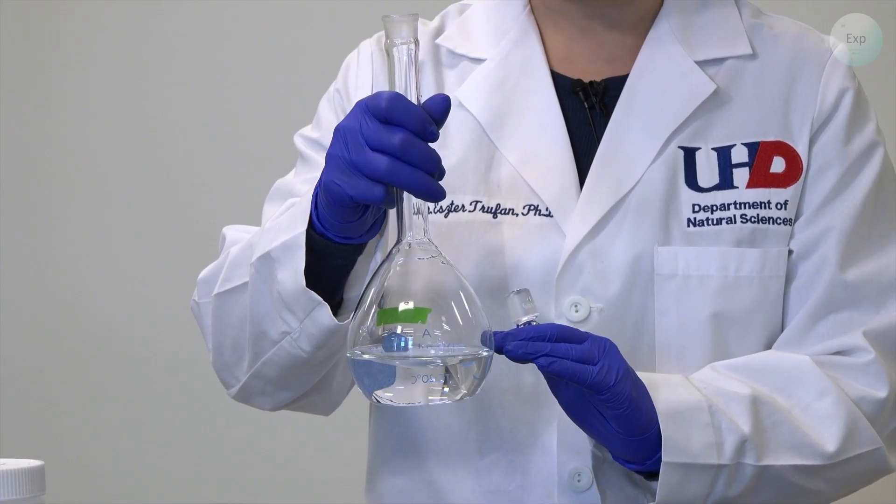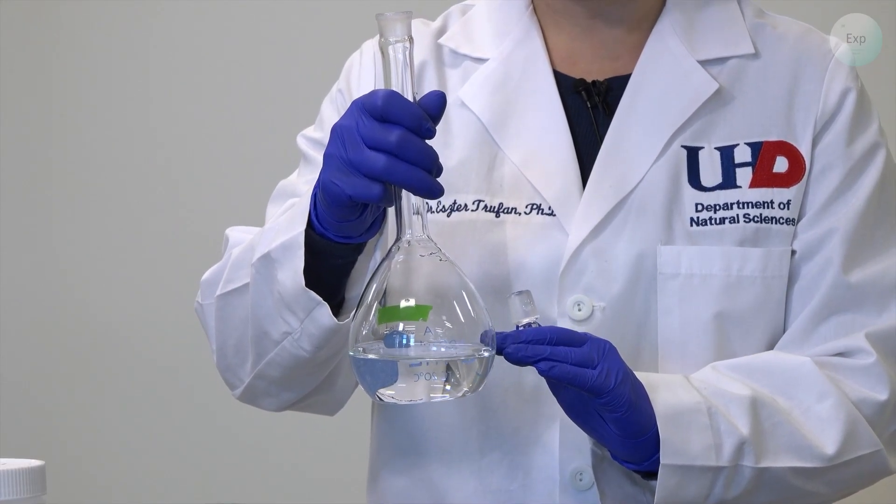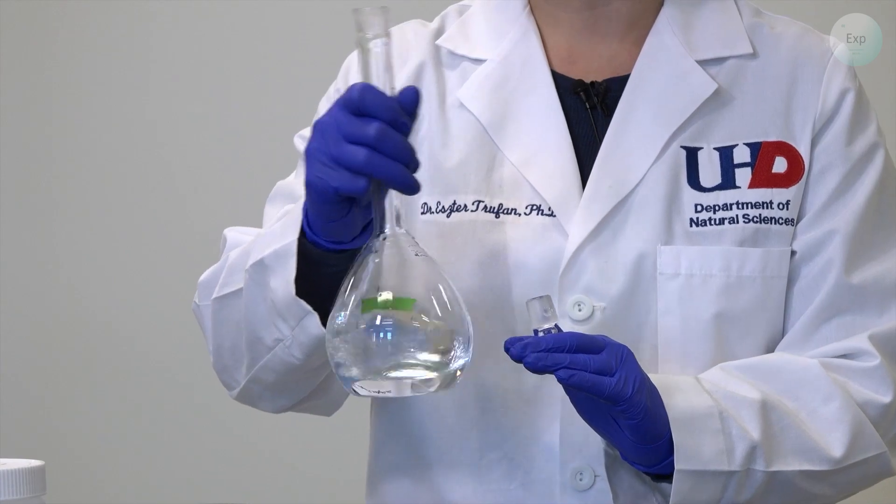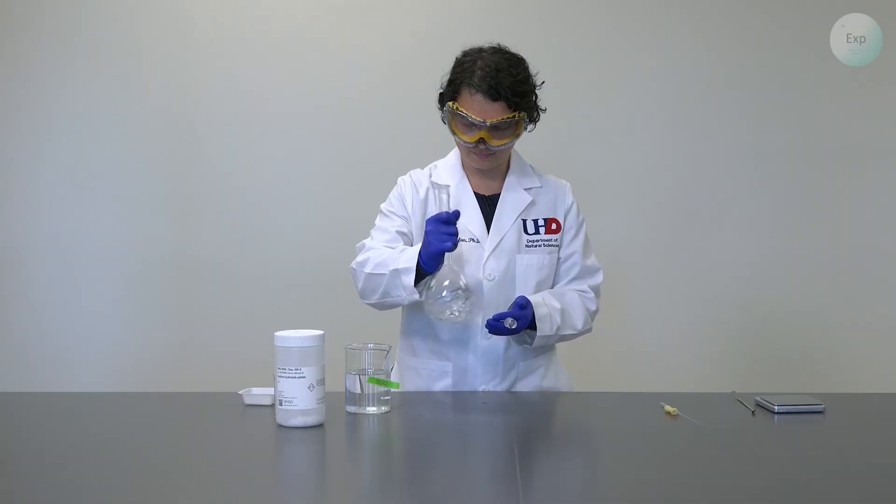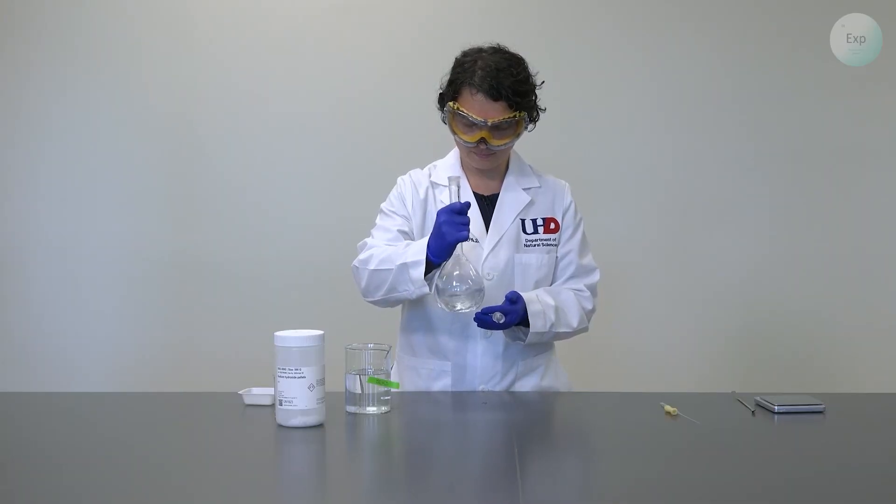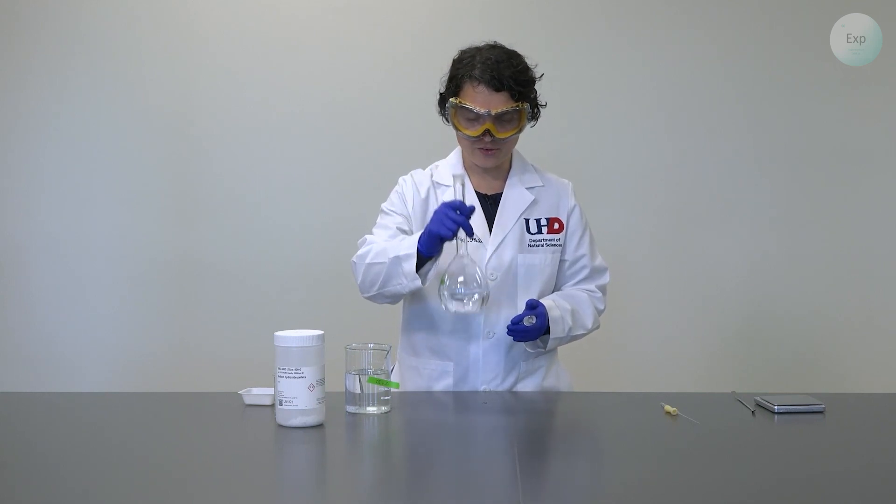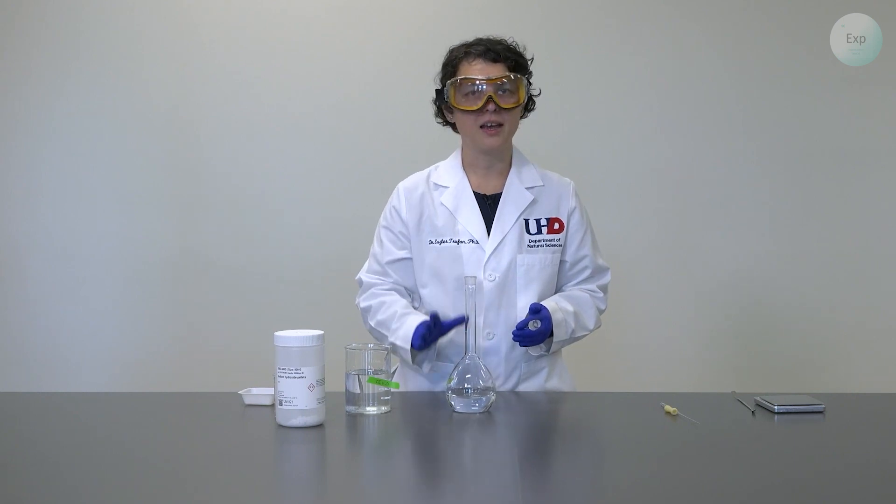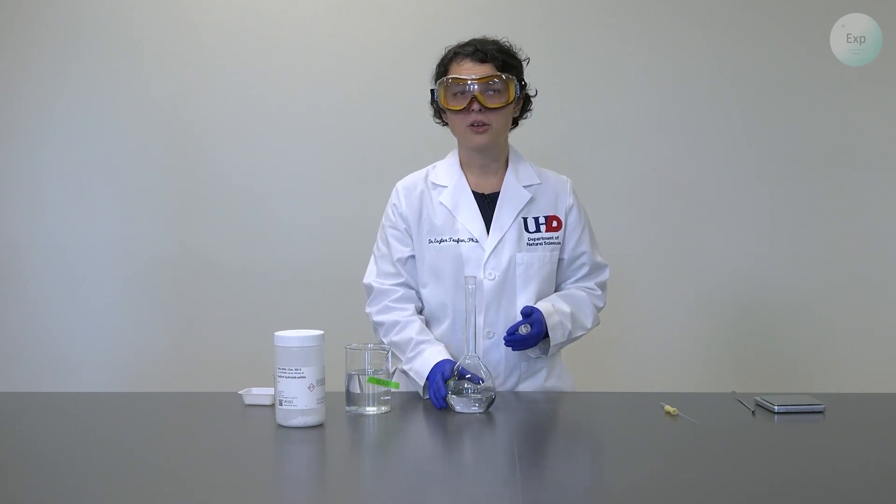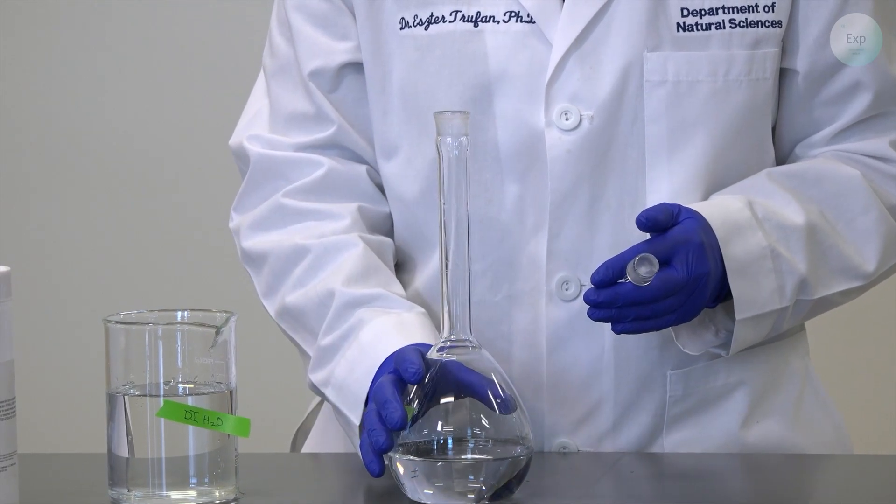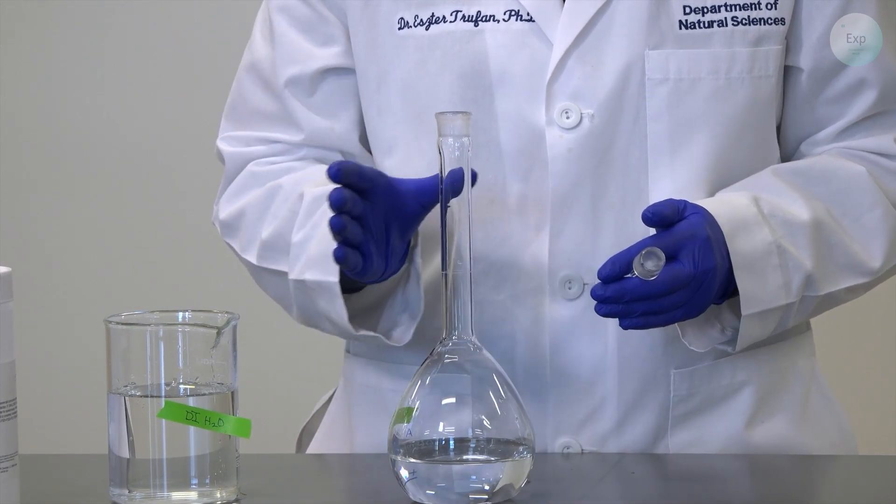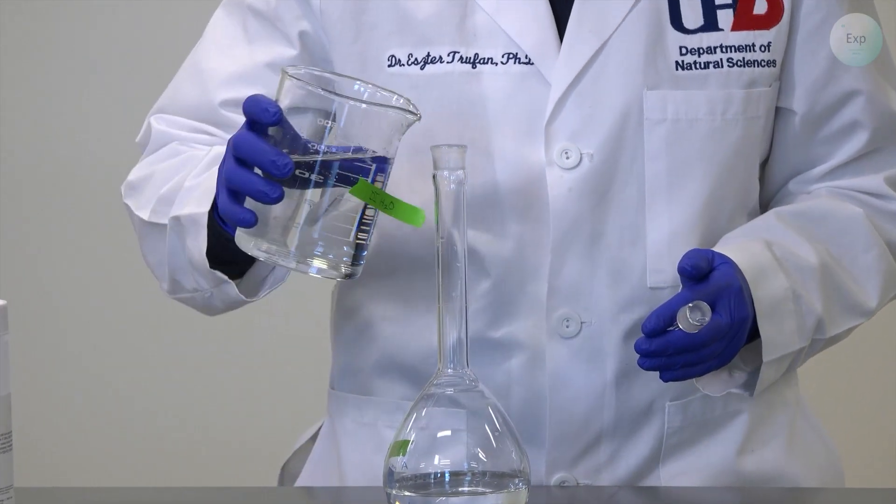And on the first addition, we don't want to add too much water because we want to retain the ability to swirl vigorously. The sodium hydroxide now is fully dissolved, and I have a homogeneous solution. For the next portions, we just keep adding the deionized water and swirling until the solution becomes homogeneous.